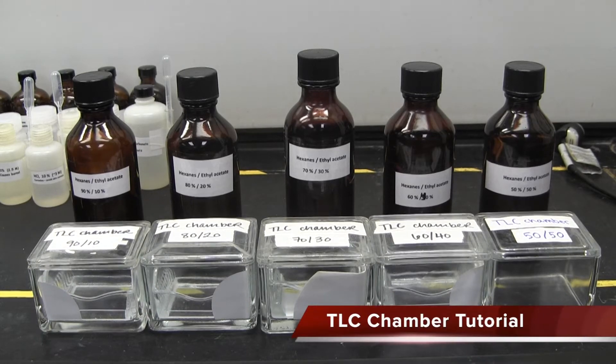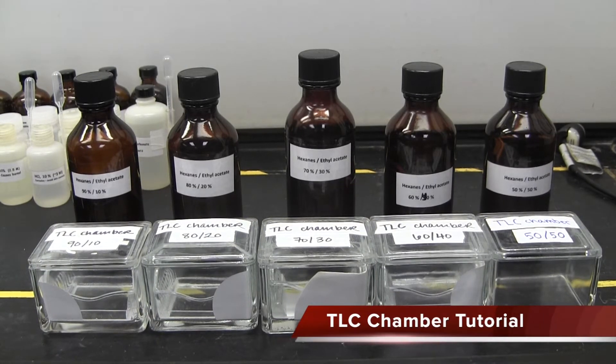In this tutorial, you will learn how to run a thin layer chromatography plate, as well as how to determine which solvent you should use for this method.